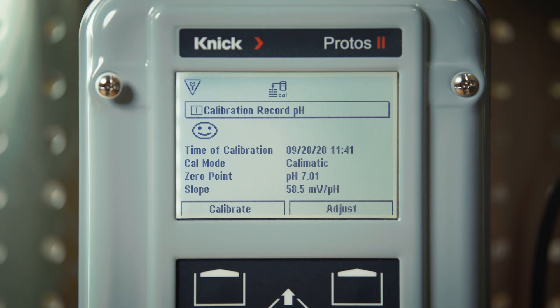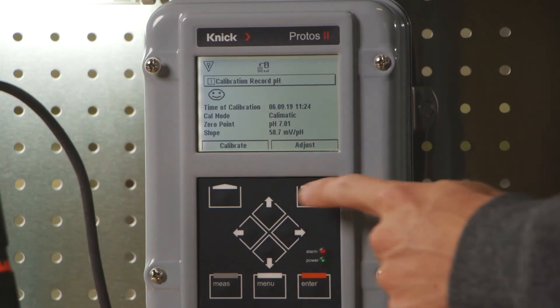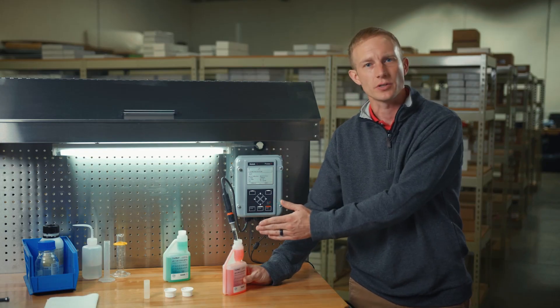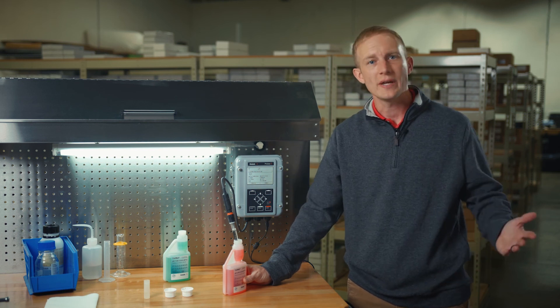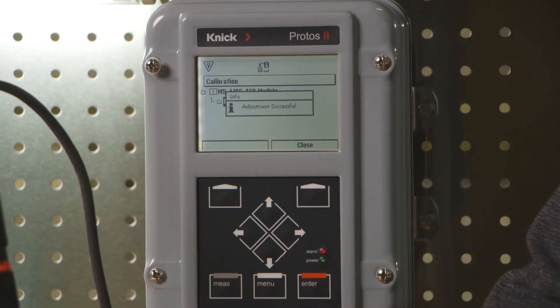The sensor face icon in the top left corner of our display indicates the status of our calibration. We have our zero point displayed as a pH value followed by the slope displayed as millivolts per pH, and finally a smiley face indicating a successful calibration. Lastly, you can see that we have the ability to select calibrate or adjust. It's important to note that no adjustments are made to the sensor without selecting the adjust button. Selecting calibrate allows us to restart the process.